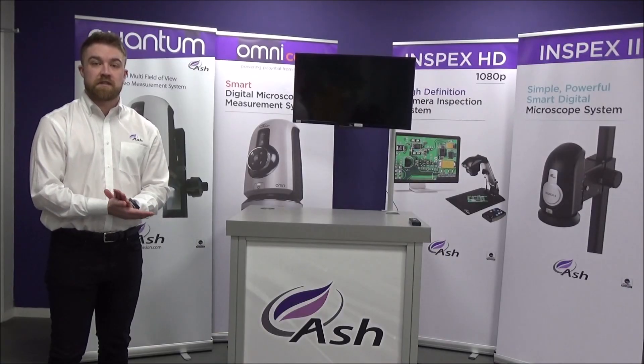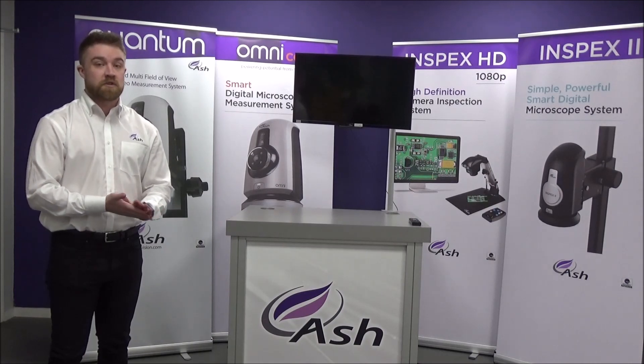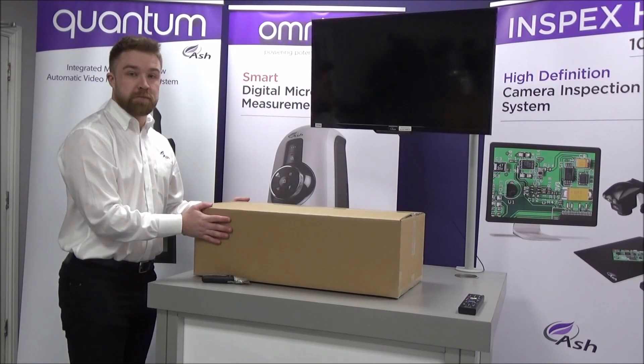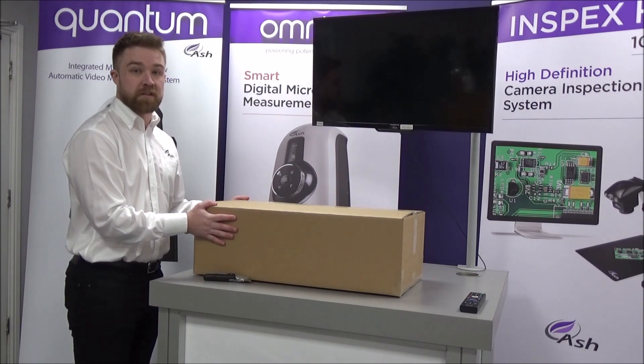Hi guys, Colin McGuire here from Ash Technologies. I work in the sales department here, based in Ireland. Today I'm going to show you how quick and easy it is to set up your Inspex II from unboxing to installation. So first we're going to start with the Inspex II stand — the illuminated track stand. I'll start unboxing and setting that up now.